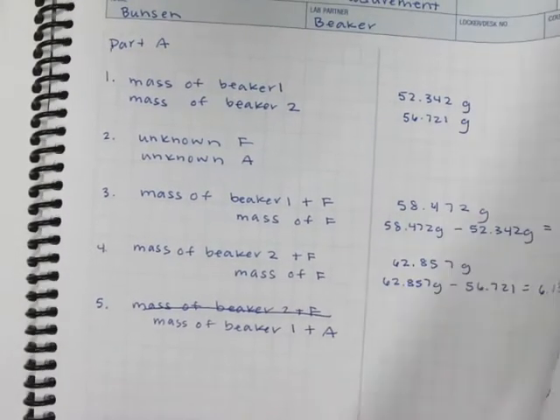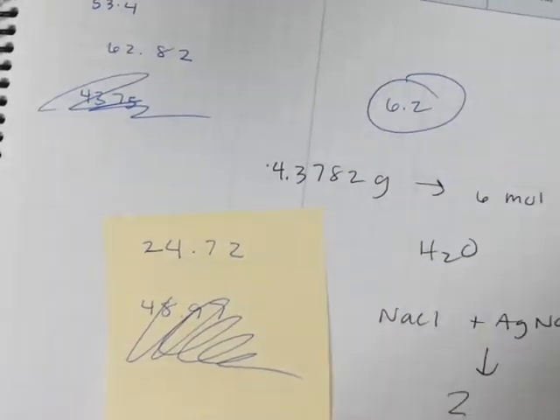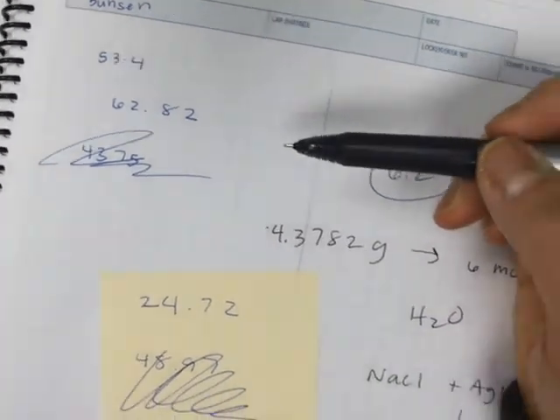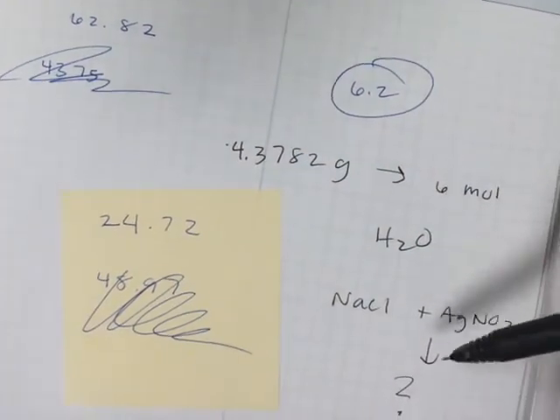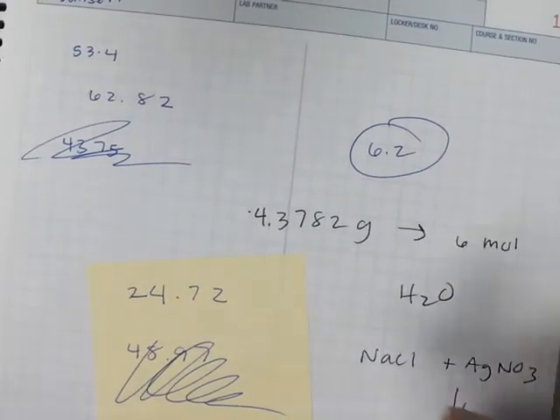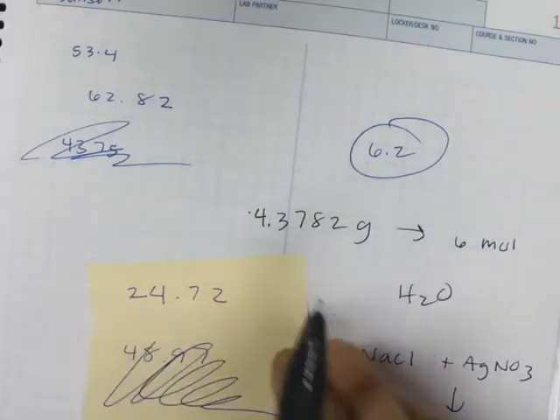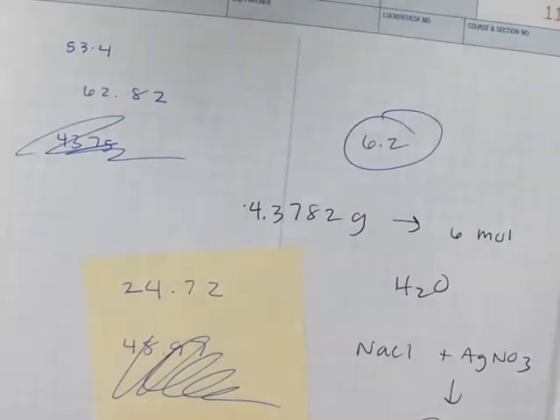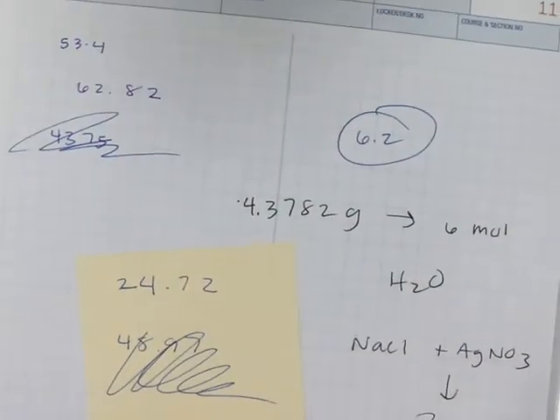One thing that you want to make sure that you do when you're making your notebook is you don't want random numbers floating around here and units and scribbles. This is a lab notebook, not a diary, so don't just scribble things. And you don't want post-it notes with data on them.